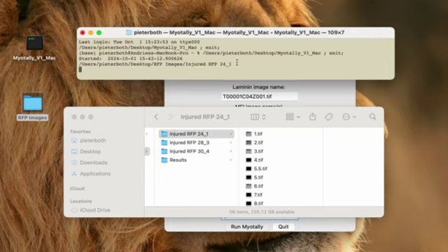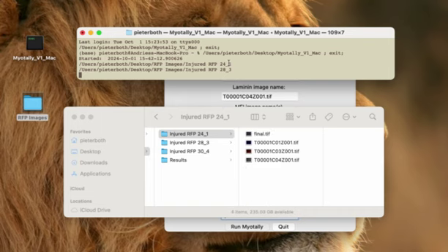So processing takes about 1 or 2 minutes, maybe 3 minutes for good quality images. For lower quality images, if you use the low image quality setting, it might take closer to 5 or 6 minutes. And this is for a single 10x image field with a 1-to-1 pixel to micron ratio. So see there, it's completed the first image folder and it's moved on to the next image folder.